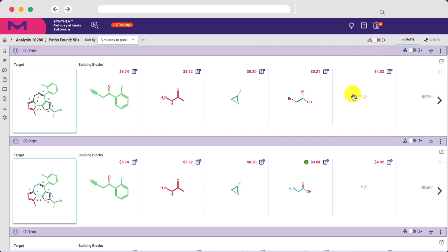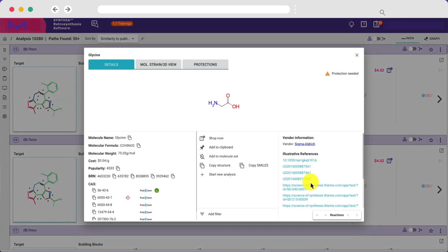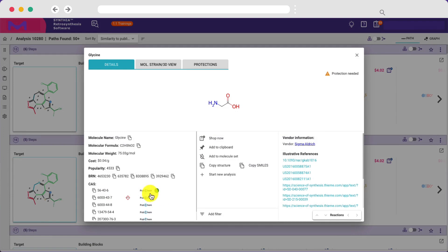You can find more information about any starting material including chemical hazard information, EPA green chemistry status, as well as links to PubChem and other references.